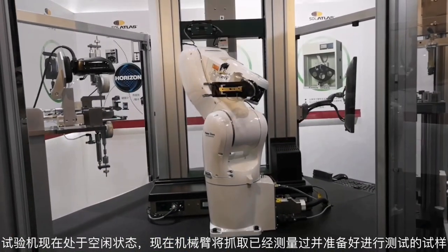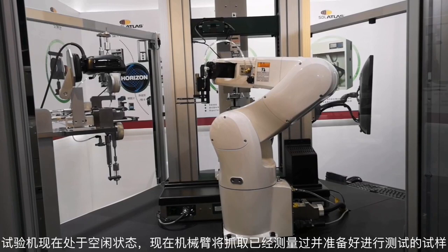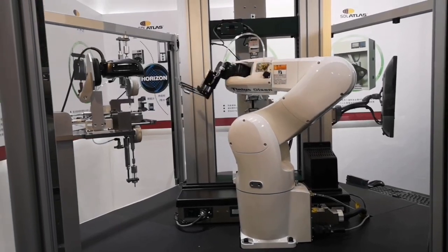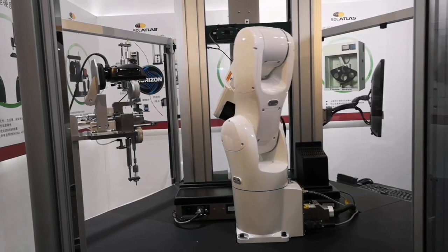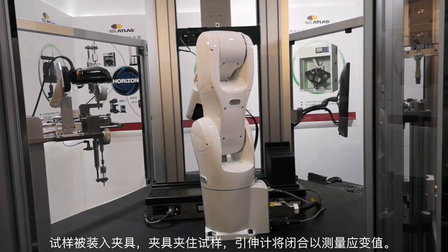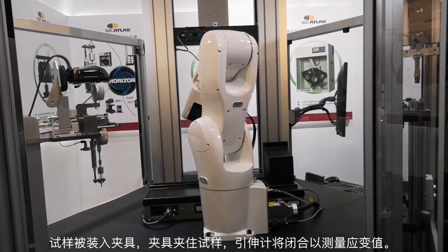All right, the machine is clear. Now it's going to get the sample that's already been measured and is ready to test, and place it into the pneumatic grips. The grips clamp the specimen, and the extensometer will close on it to measure the strain value.